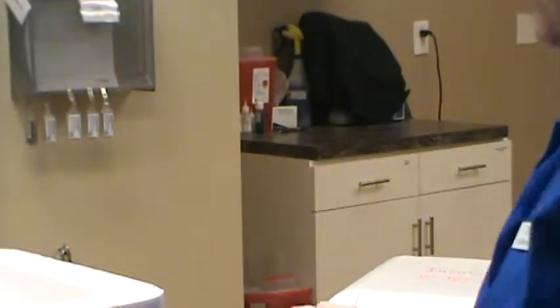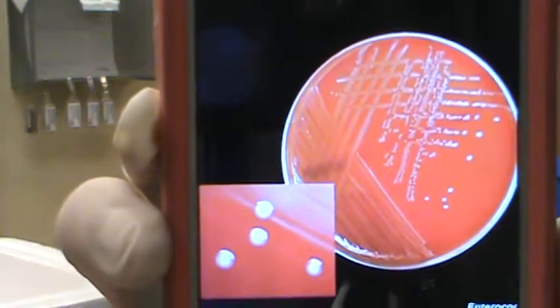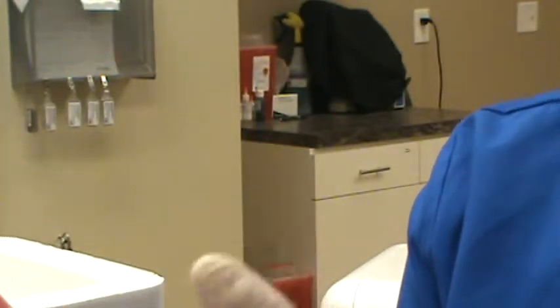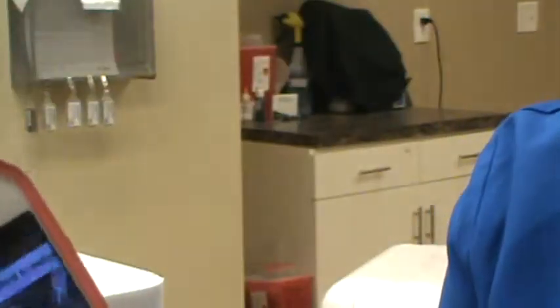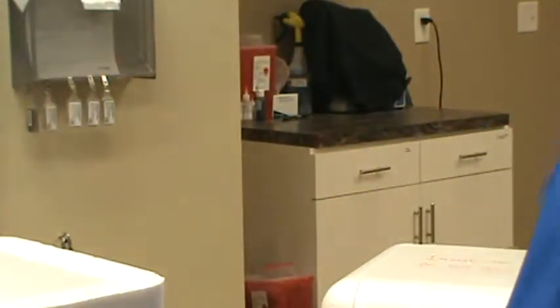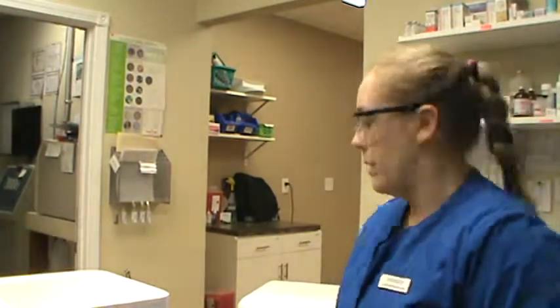Right now I'm going to talk about some of the bacteria that we could be seeing. What we're seeing looks a little bit like this, the little dots. And this would be if we got better growth. We just don't have that good of growth right now. And potentially that's really good growth right there, but we are not seeing that either. So I'm going to put the few little antibiotic discs on there, see if that takes care of whatever bacteria that is, see if it's sensitive, and we will come back once that's finished and write it in our patient chart here.